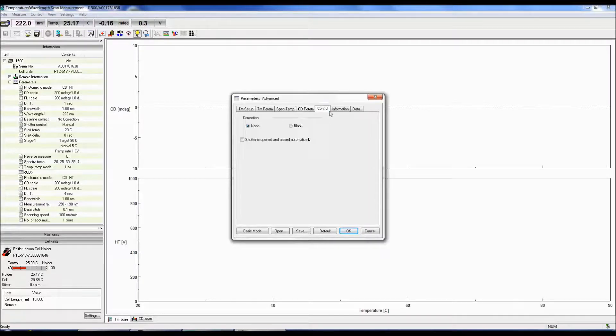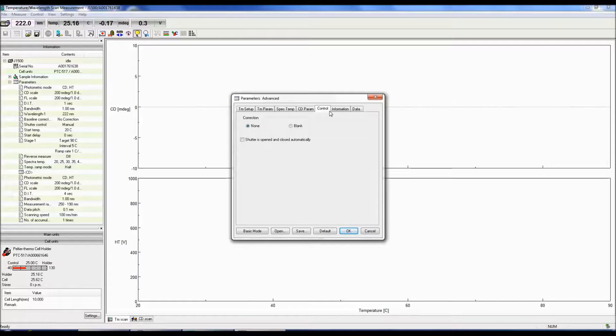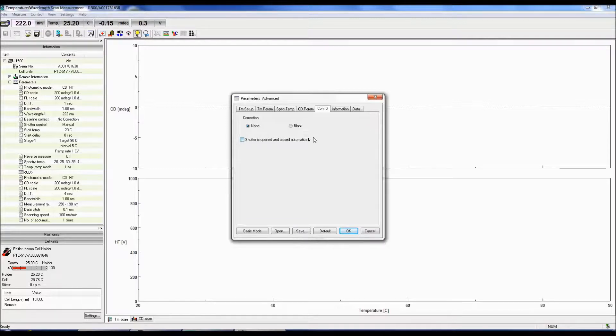Now we can click on the Control tab. Here you can select whether you would like to correct your CD sample spectrum with a baseline spectrum. If you choose to correct with a baseline spectrum, you will only have the corrected sample spectrum, not the raw sample spectrum, at the end of your measurement. You can also choose to open and close the shutter automatically.